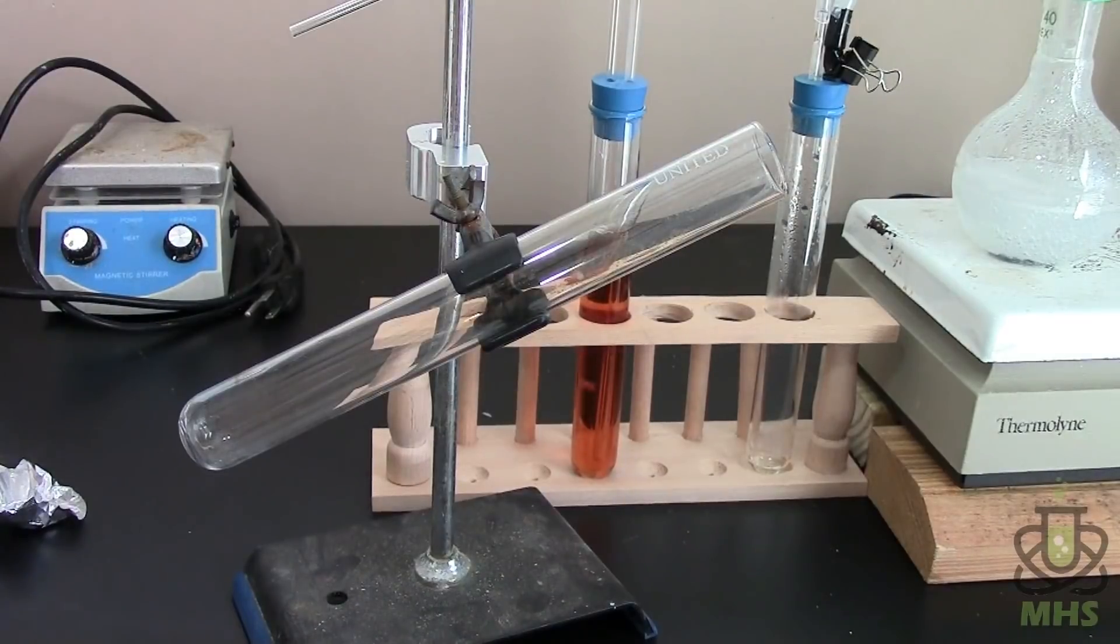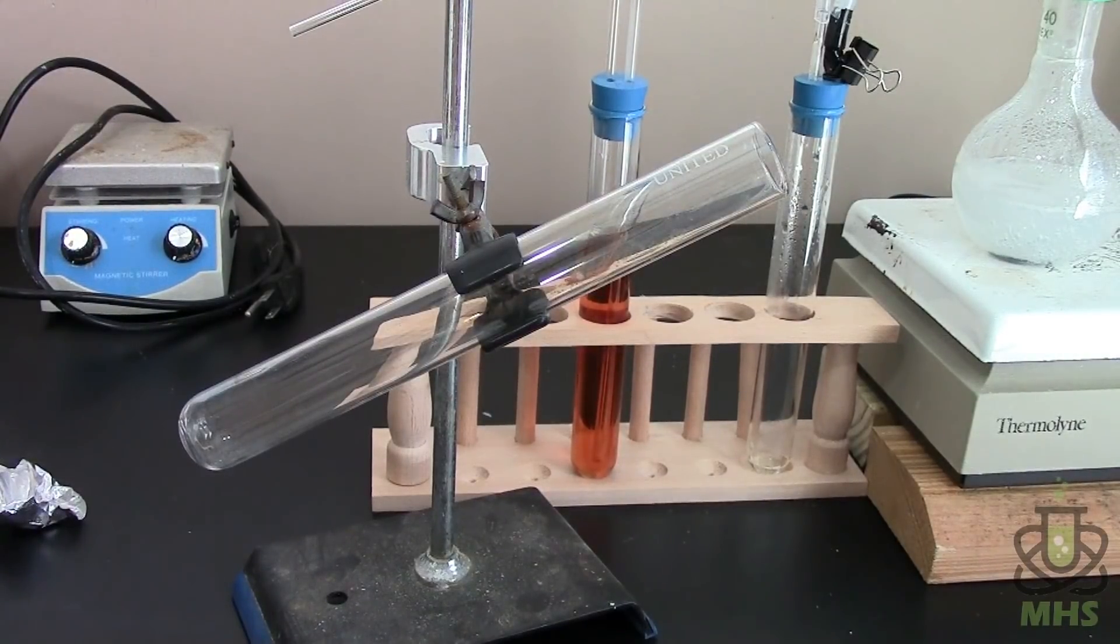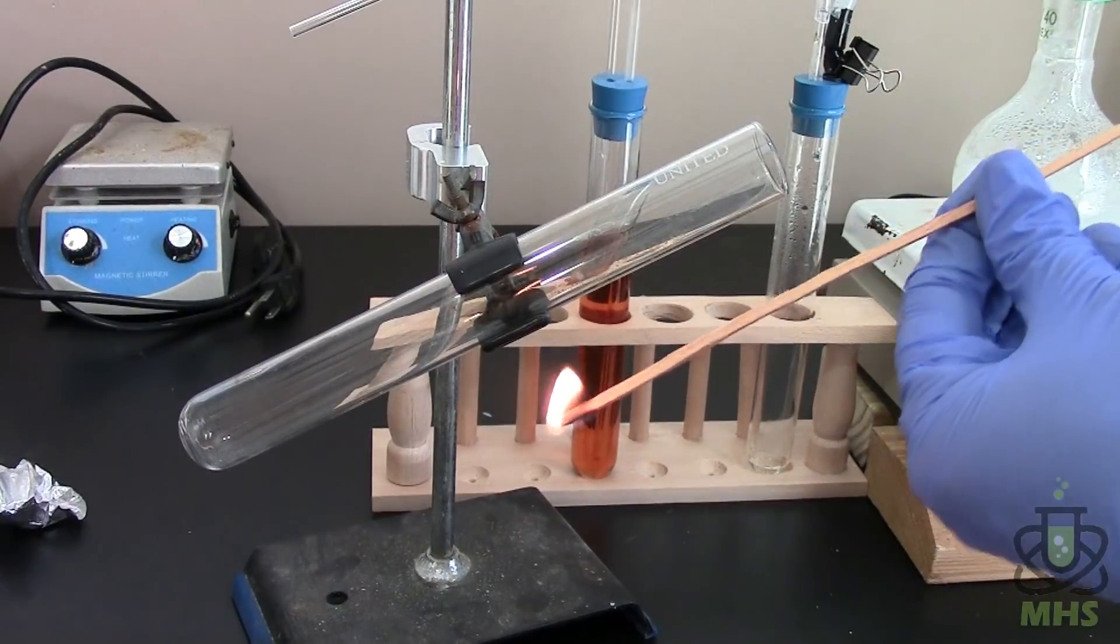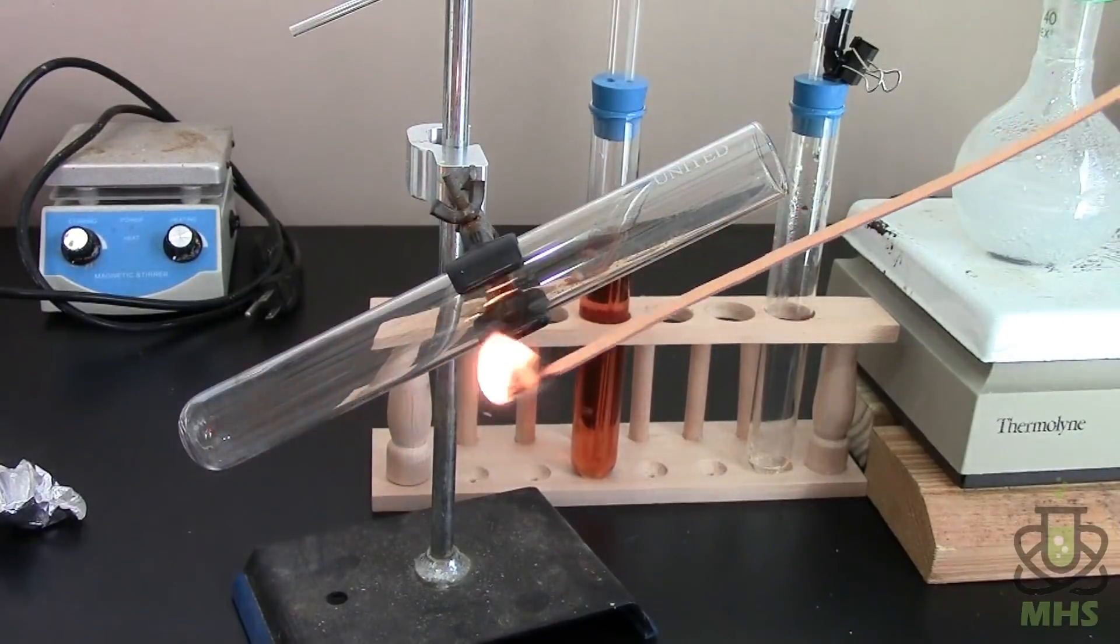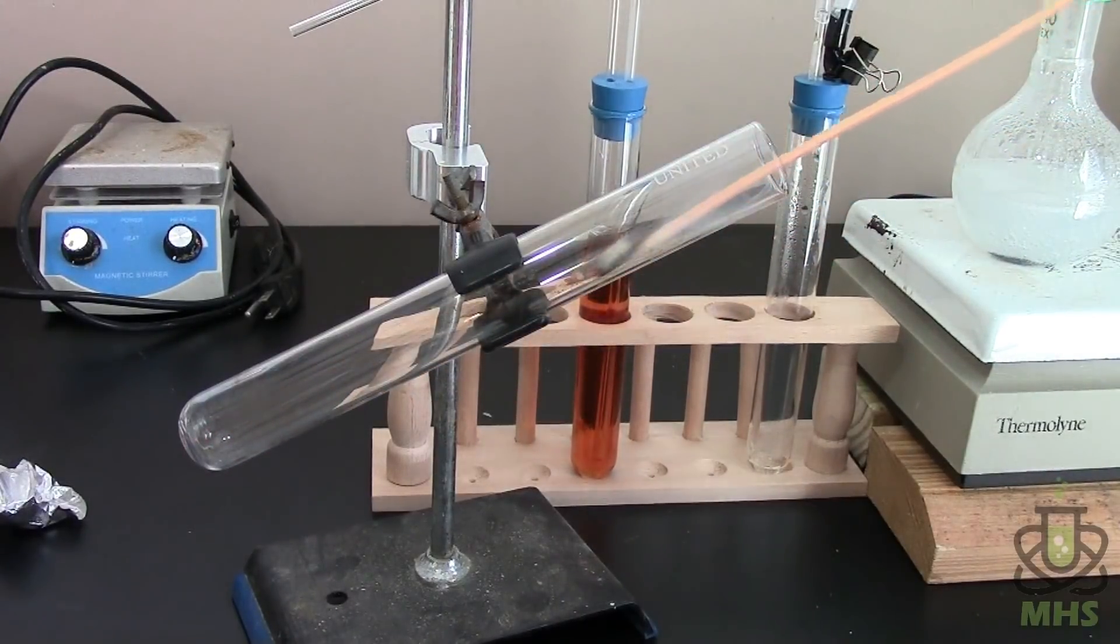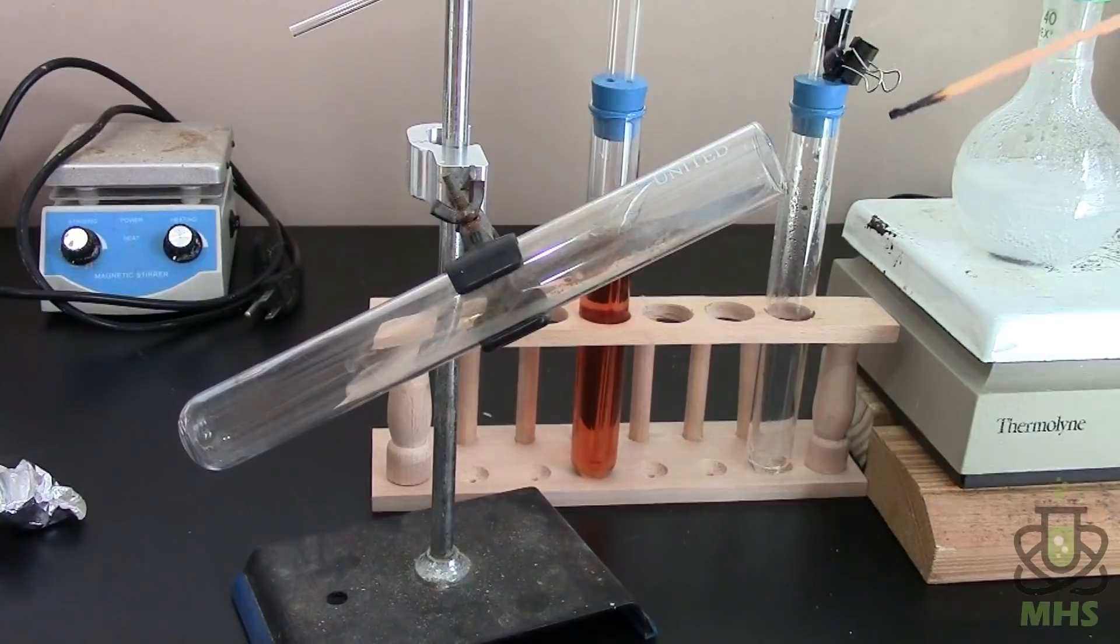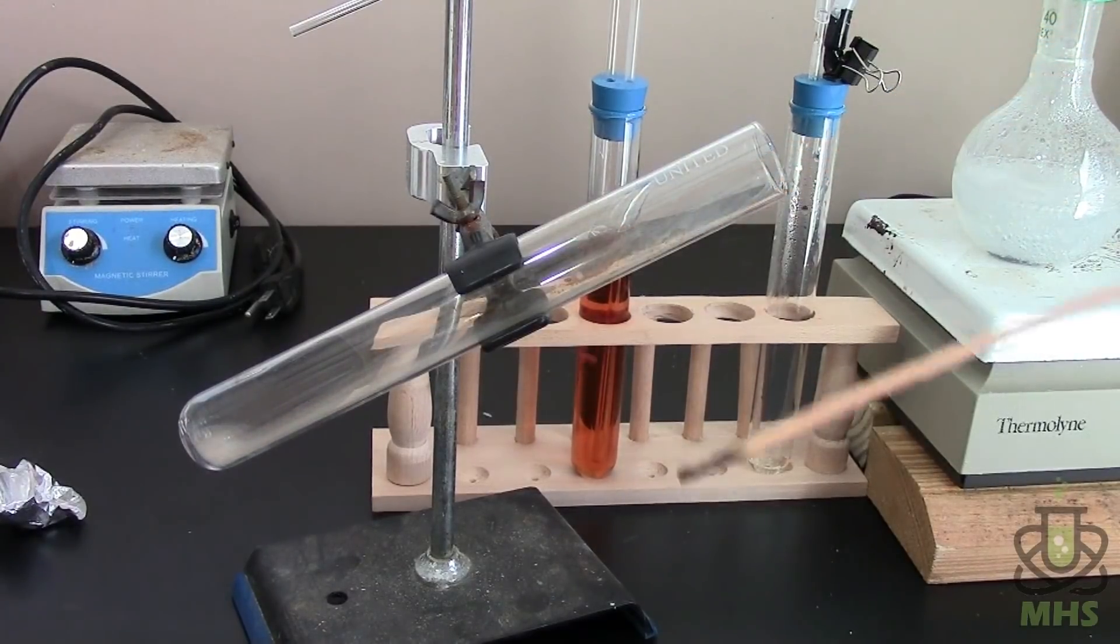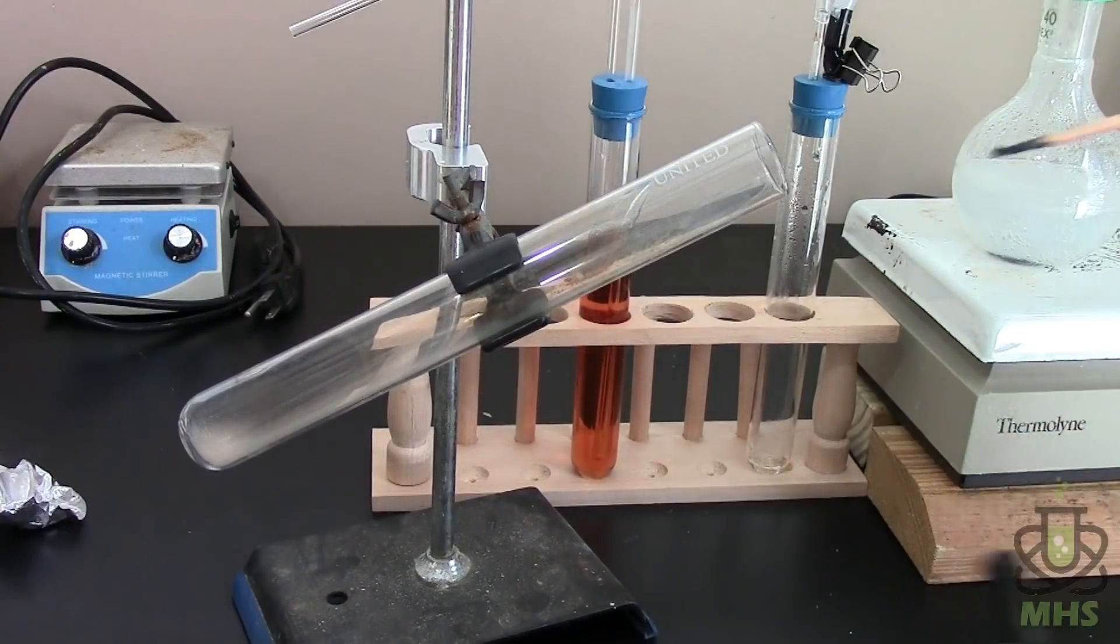So the test I'm going to do is the lit splint test which will tell me if this is a non-combustible gas. So I've got an extra long splint here and we'll plunge it into the gas and see if it extinguishes the fire. Hey! Awesome! Started about right there. So this is actually pretty full. That's great. Let's do it again.